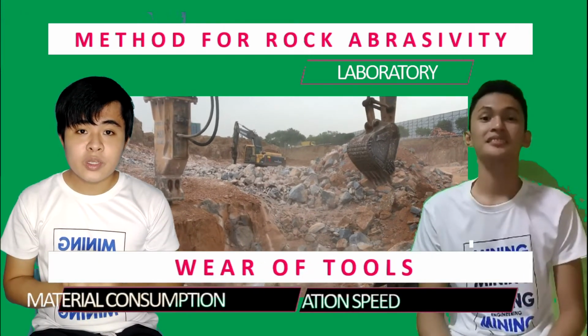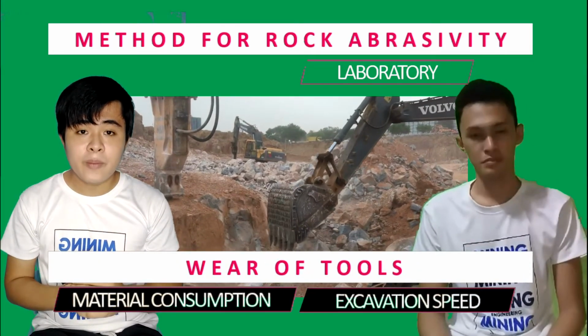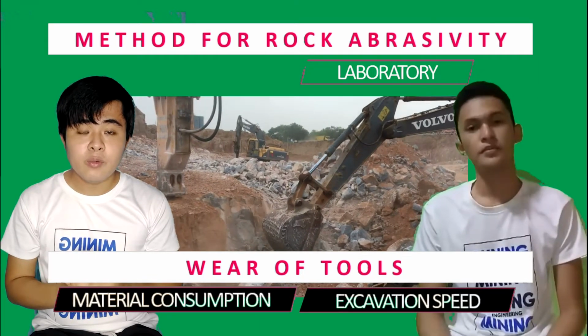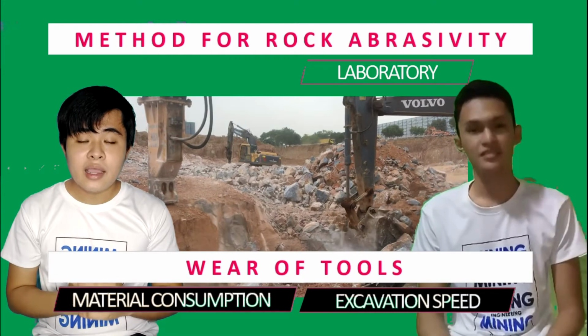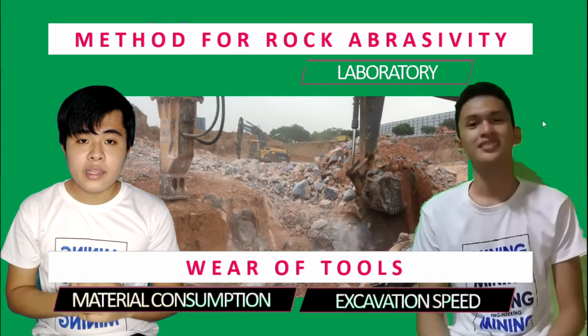Hereby, the wear is a question of material consumption and of the excavation speed, which is an important indicator of rock excavation for tunneling, underground mining, and quarrying.